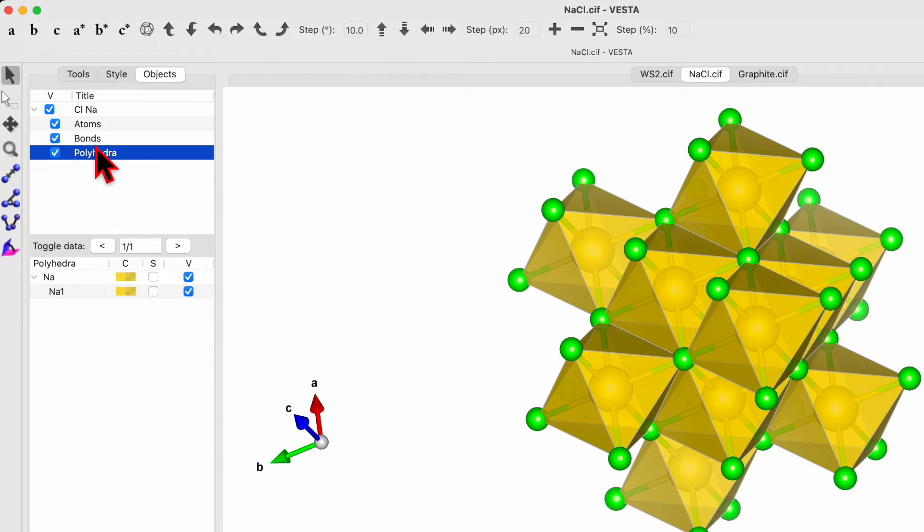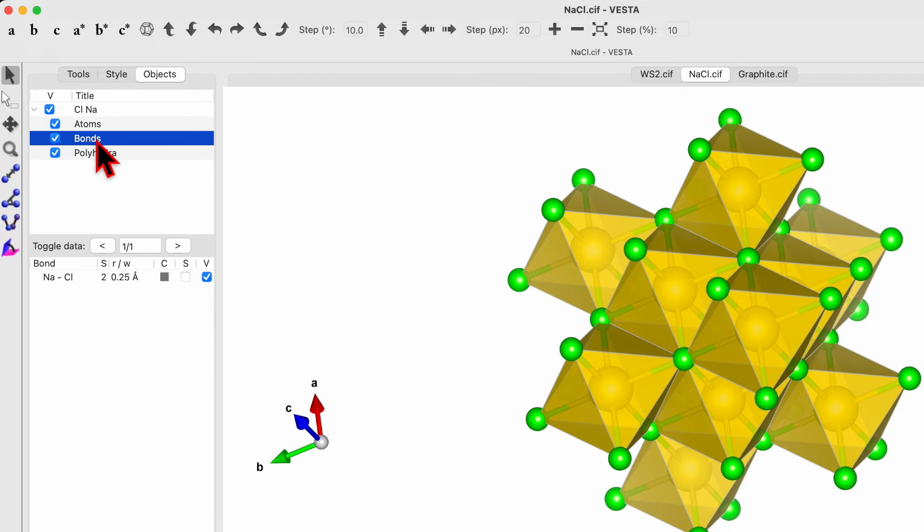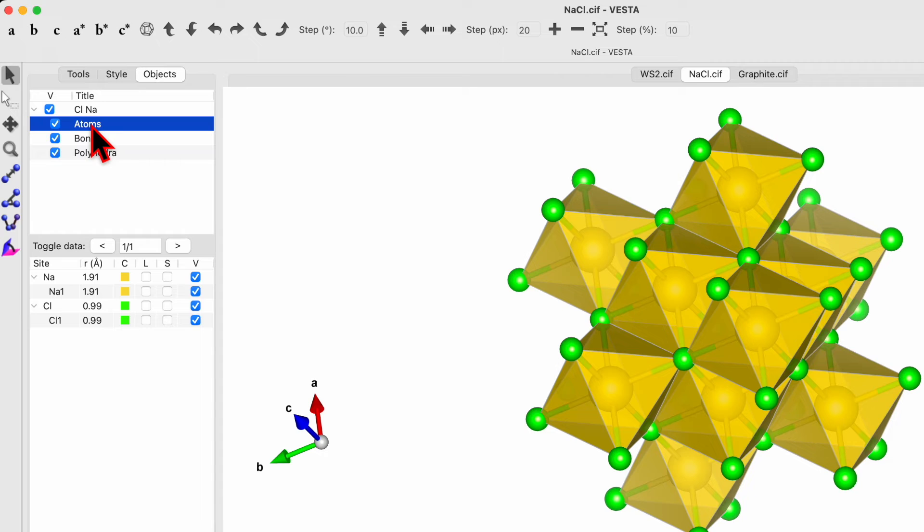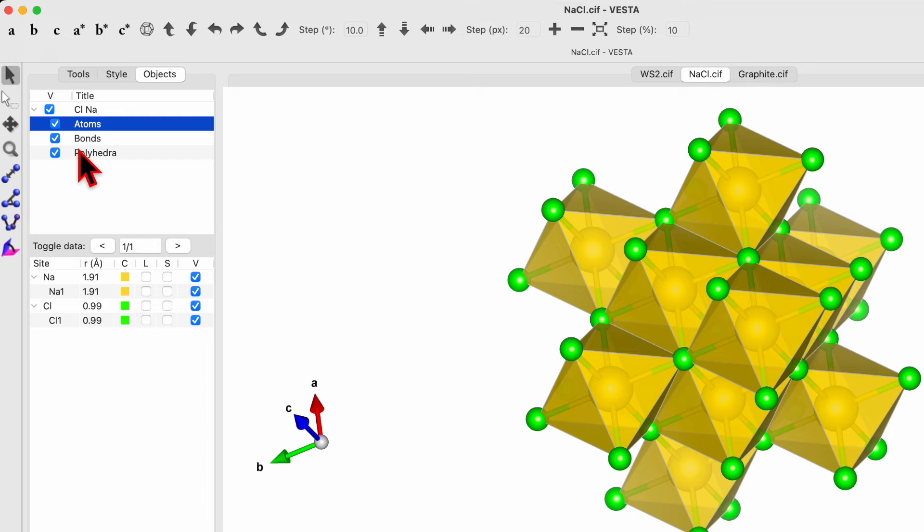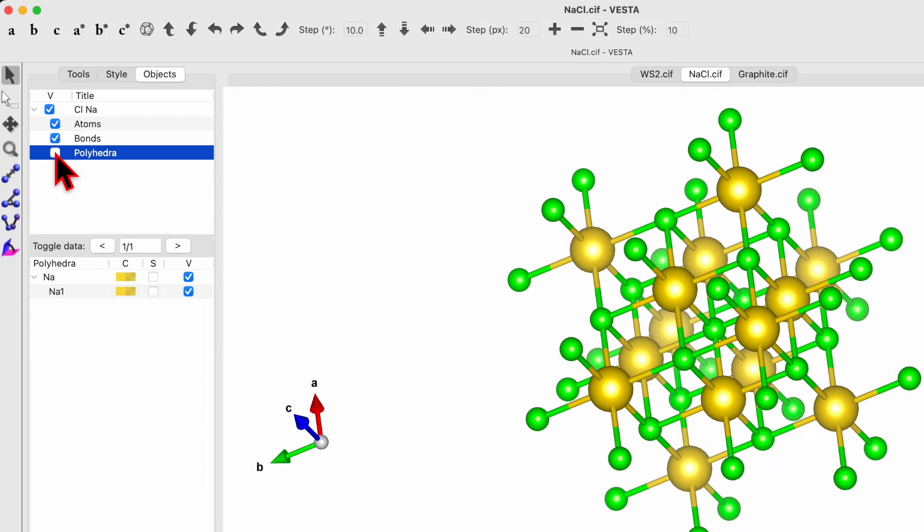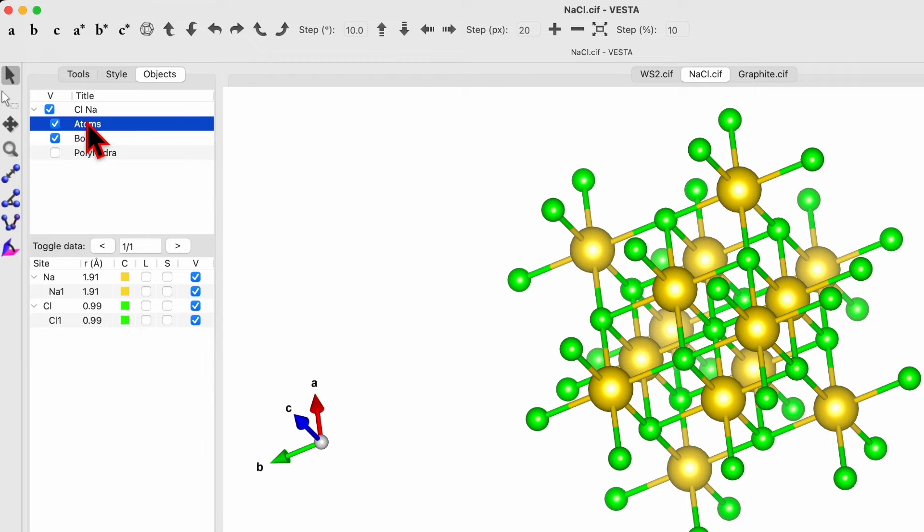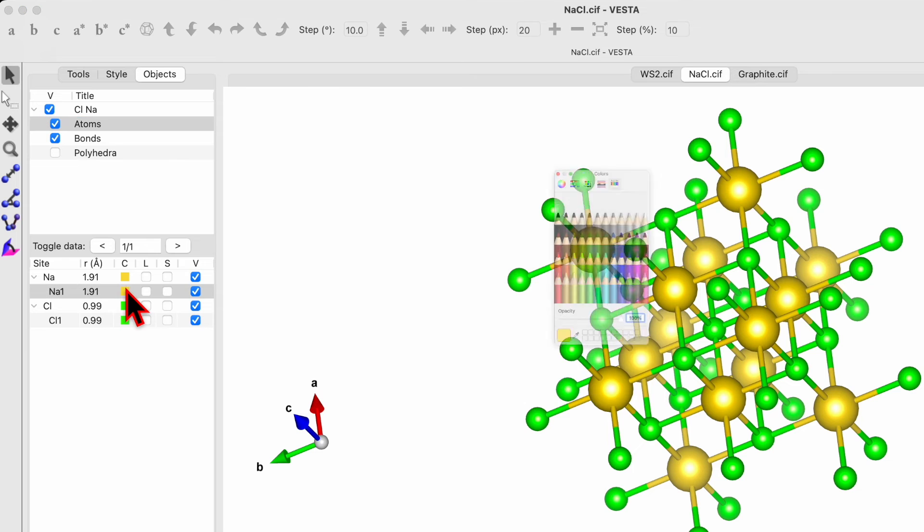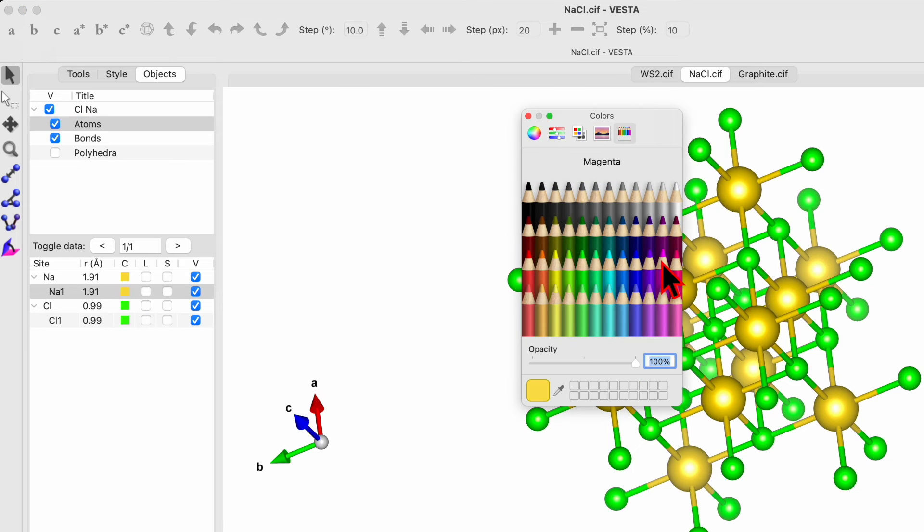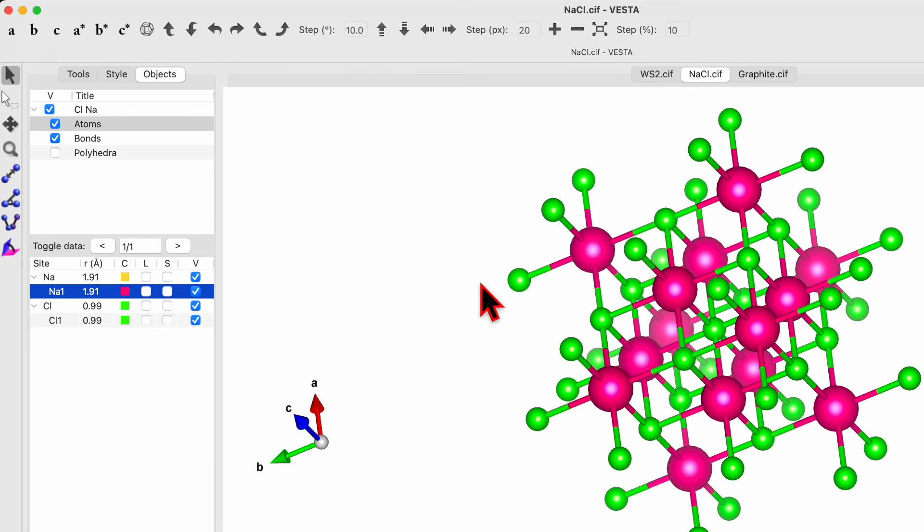Now if you click on the polyhedra, over here you can change the color. If you click on the bond, here you can change the color for the bond. If you check the atom, you can change the color of the atom. So let's first uncheck the polyhedra, click the atom and here change the atom color, say pink. So it's pink.